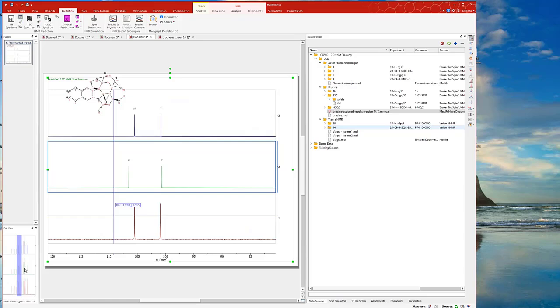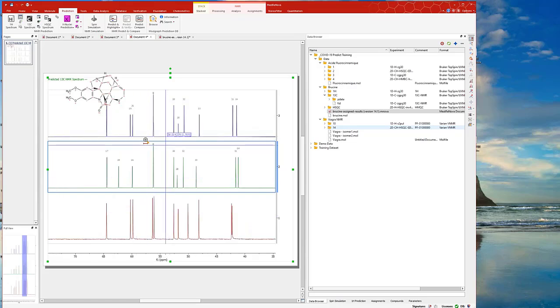It's still a weighted way of doing the prediction. I mean, it's a weighted combination of the previous database and your new data, right? You can see here, it's not exactly the same, right? But the prediction definitely is much better than the prediction without the training, right? Okay, so that's the prediction with the training.